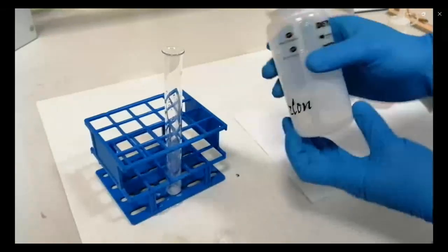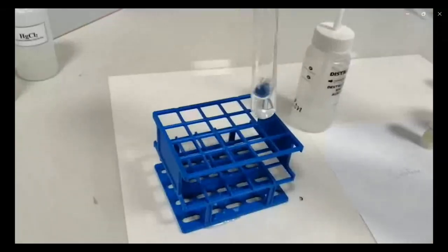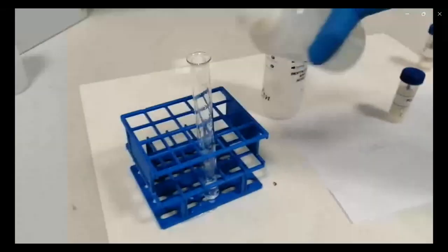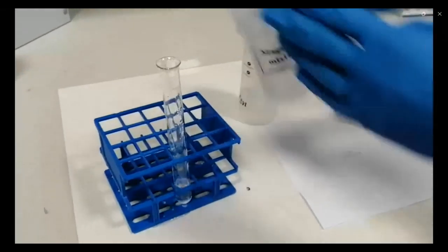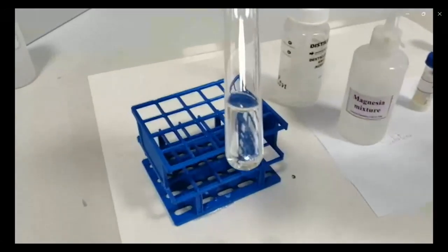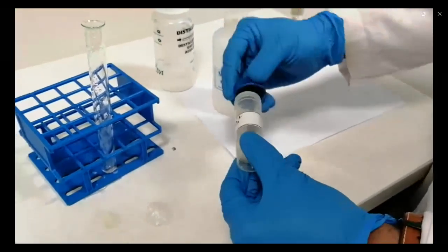We are going to do it also for sulfate to see nothing happen. Just prepare a solution, mixing a few crystals with a few milliliters of water, mix them very well, and then add magnesium mixture. Nothing will happen. No reaction. Just to remind you, the magnesium mixture is a mixture of 3 components: magnesium sulfate, ammonium chloride and ammonium hydroxide.